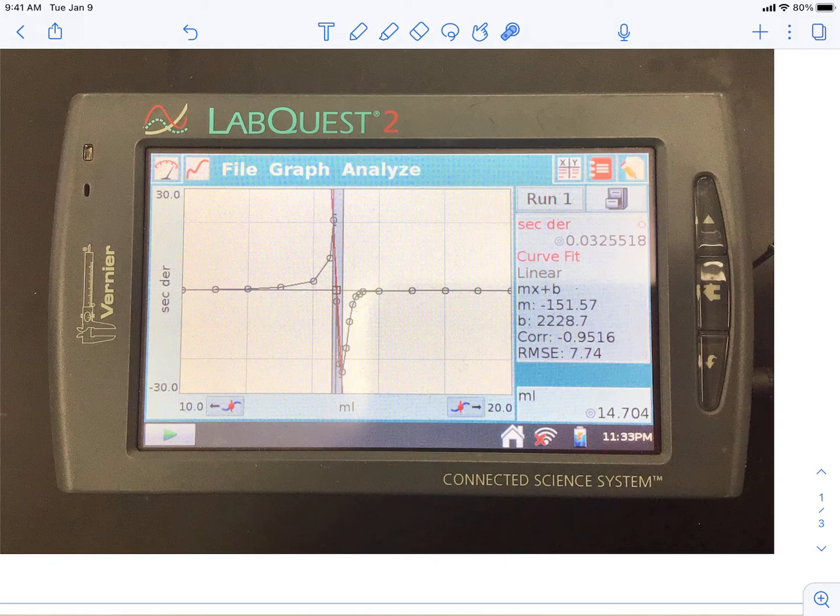Since we didn't have that, what we had done is selected this area, which is darkened, and we drew a line of best fit through some of these data points. Then we interpolated, and we used our buttons here and here to try to get a point of our second derivative really close to zero. And that's what we have around the box. That's as close to zero as I could get. So that's what this box is telling us. That box is this value here.